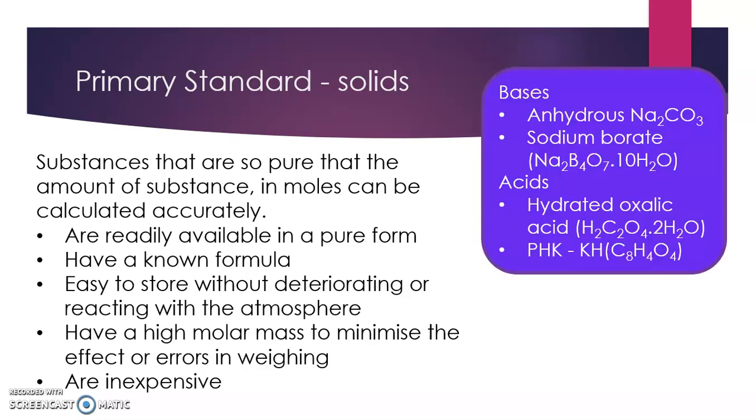Commonly used primary standards for bases, we use anhydrous sodium carbonate. The sodium carbonate looks like it's a salt, but it's actually a weak base due to the hydrolysis of carbonate anions in water. Okay? And we also use sodium borate as a weak base. Both of these bases are weak bases.